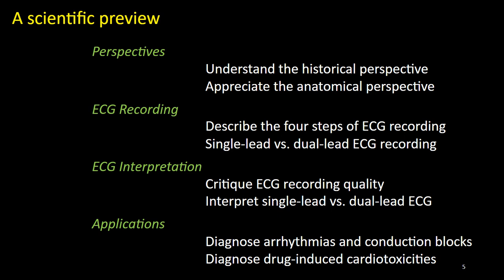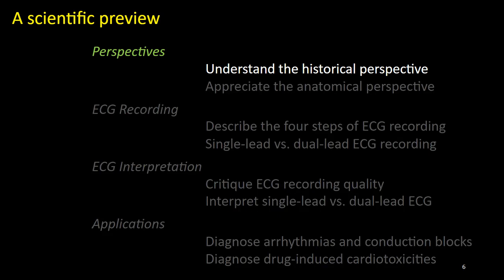So today, we will review briefly the historical perspective of the ECG recording method. We will compare the anatomical perspectives unique to the adult human and zebrafish heart. We will describe the 4 basic steps in ECG recording, be it for single lead or dual lead. We will find ways to improve the recording quality. We will interpret ECG. And lastly, we will demonstrate some clinical applications of zebrafish ECG in the diagnosis of arrhythmias, conduction blocks, and drug-induced cardiotoxicities. Let's start with the historical perspective.